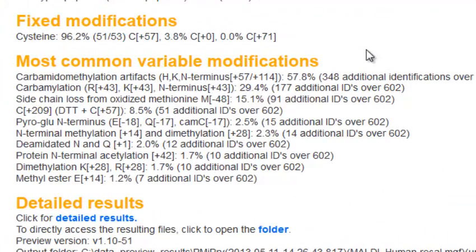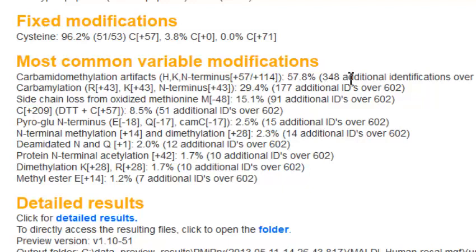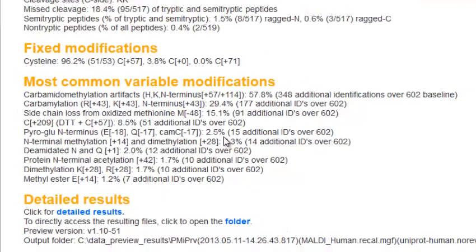Preview's summary page gives a ranked list of the most common variable modifications and how many more identifications we would gain by enabling these modifications in a full search. The sample is heavily overalkylated — we can obtain about 60% more identifications by enabling variable modifications of +57 and +114 Daltons on histidine, lysine, and peptide N-terminus. This sample also has widespread carbamylation, and we can obtain about 30% more identifications by enabling this in vitro artifact. It also has side chain loss from methionine and a number of other modifications.